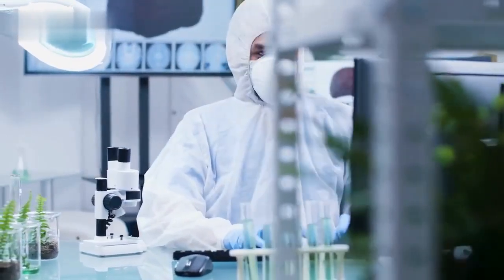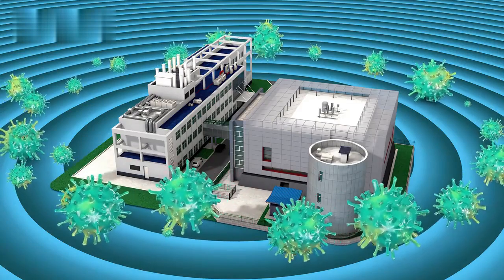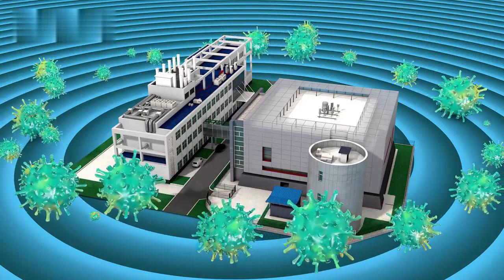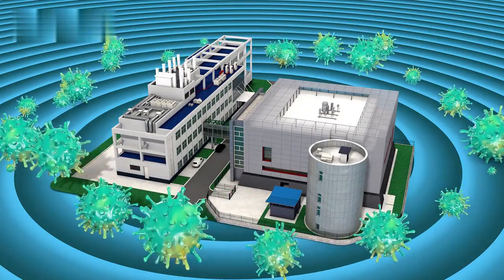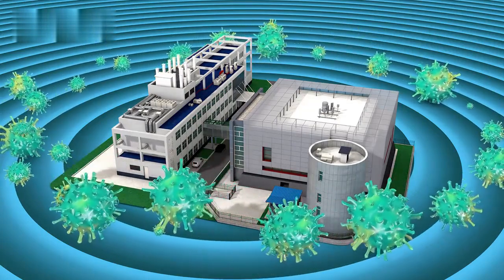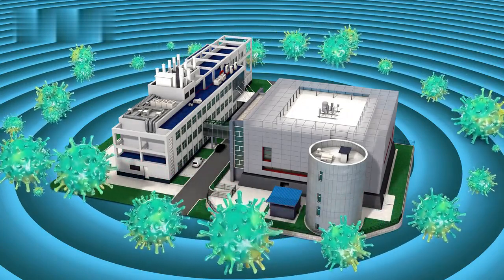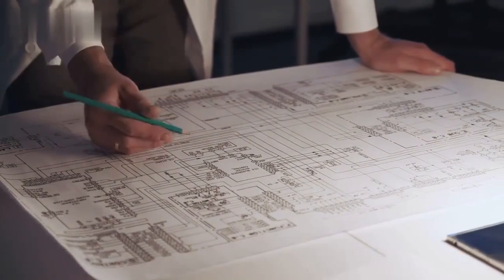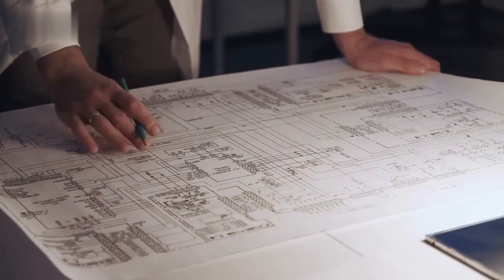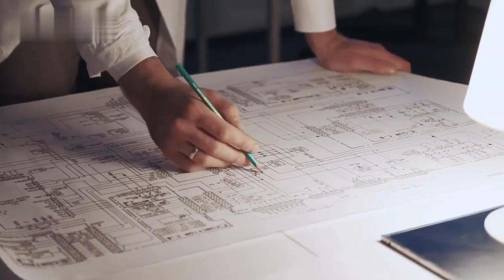There are many similarities between biosafety and biosecurity, but they are not the same. Various levels of laboratory controls and containment, access controls, personnel knowledge, the use of specialized containment tools, such as biosafety cabinets, and established operating procedures are all used to achieve biosafety. Biosecurity is accomplished by limiting access to the research facility, research materials, and information associated with that agent and/or research.